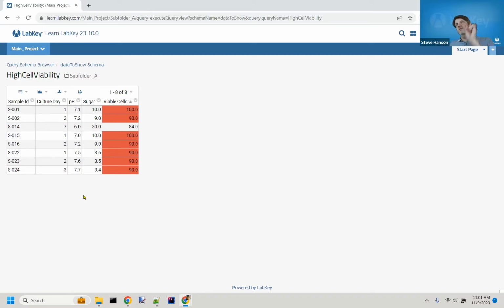And so this is one of those great techniques for highly controlled data presentation that you can use in LabKey. And this is essentially row-level security for LabKey and column-level security. You have full control over what you want to show using this kind of technique. And I consider this now, I'm paying off on my promise I made back in October to really show in detail what I was talking about.